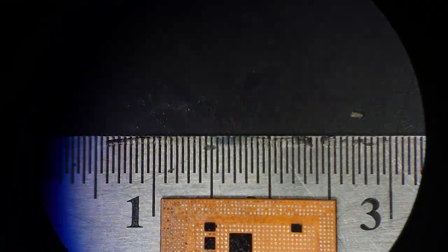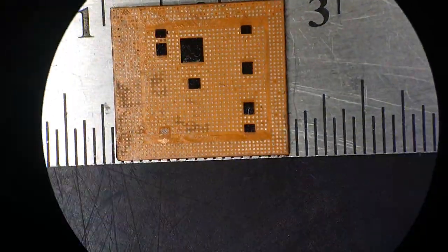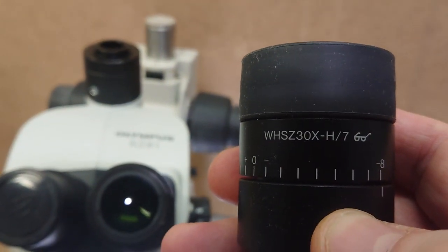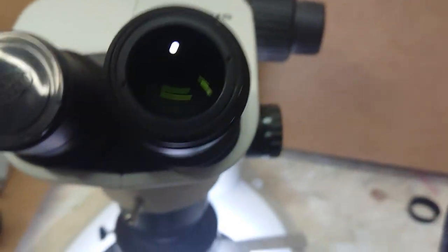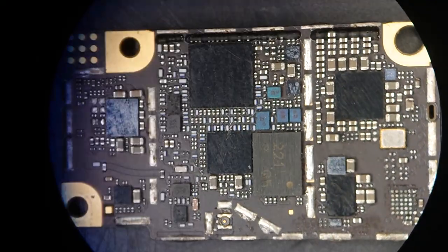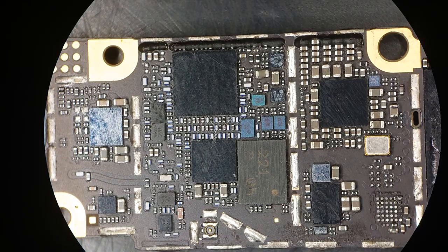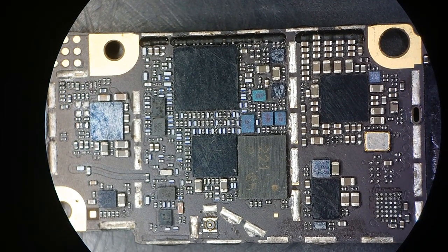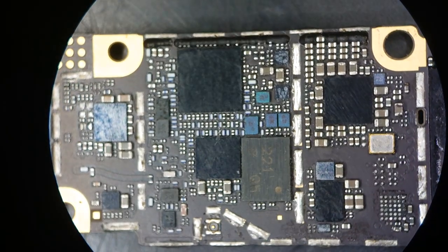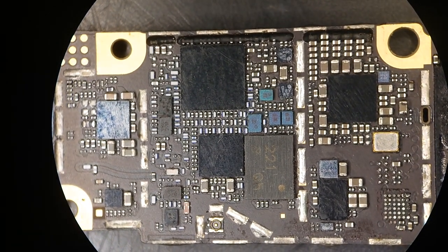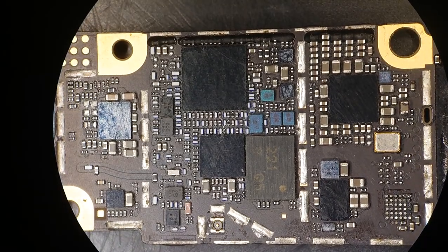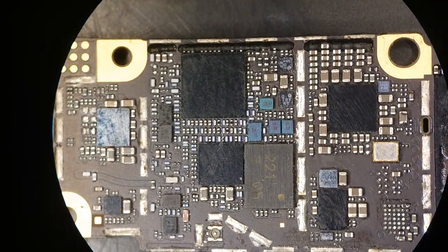To see how this thing works with the processor I would need to change eyepieces with my 30 times Olympus eyepieces. Only then I can reach the maximum resolution of the optics to see how it really shows us the picture. But for a while let's just see the field of view on the iPhone 7 motherboard. We can easily see here that we have pretty nice field of view.